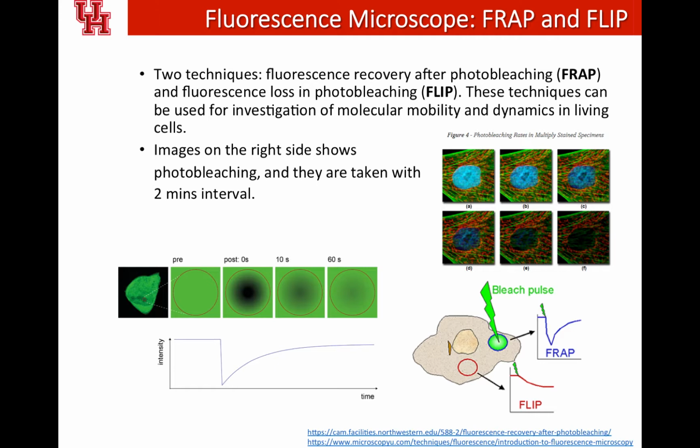The fluorescent molecule looks like a boat in the sea, right? It's moving around with the waves. Because you bleach them, you kill them, and then new boats, or new fluorescent molecules, will diffuse back to this depleted region. That's why the intensity suddenly jumps down because of bleaching, and then slowly recovers because of the diffusion process.